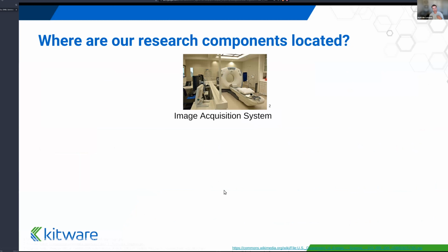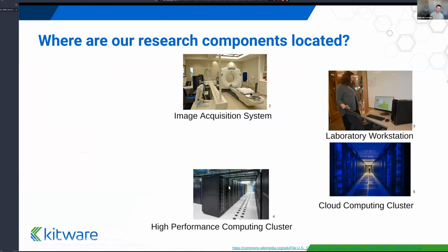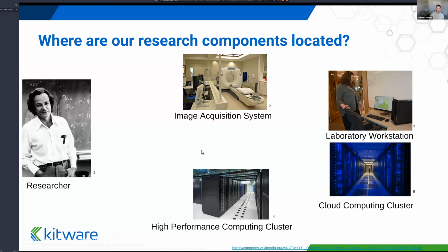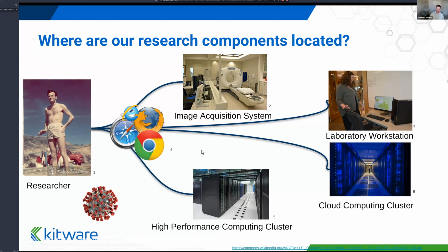This is extremely appropriate and helpful for science and research, because today we often have this situation where we're acquiring the data on a microscope somewhere that's in a fixed location, but we also have to do compute with very expensive resources that are located in other places, like the laboratory workstation or the AWS cloud or a cluster. And we would like to interact with that data. The best way to do that is a web browser, either at home or, if we're in nice North Carolina like where I am, we can do that through a web browser.